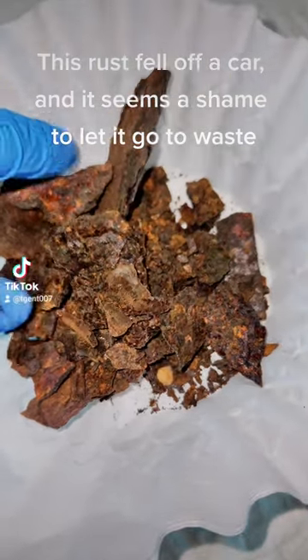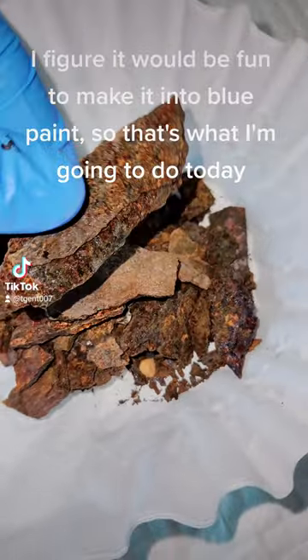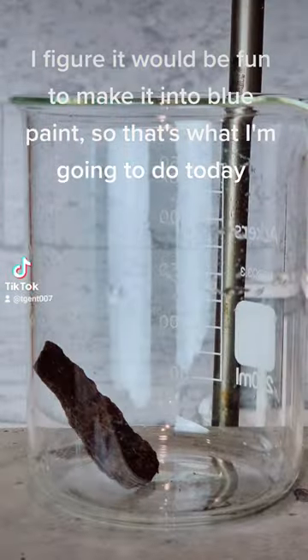This rust fell off a car and it seems a shame to let it go to waste. I figure it would be fun to make it into blue paint, so that's what I'm going to do today.